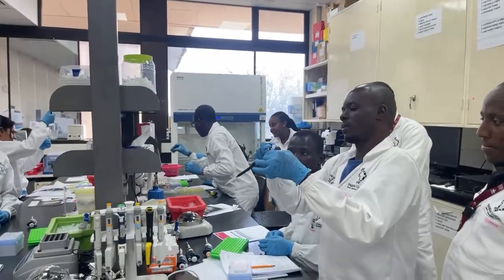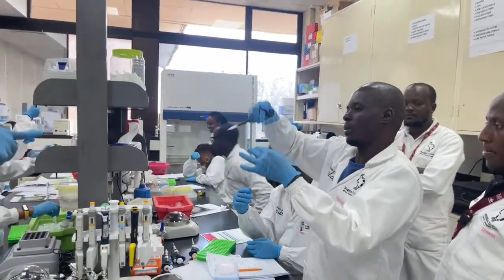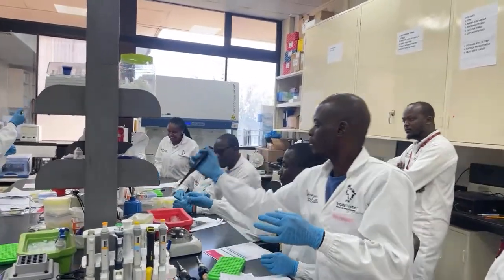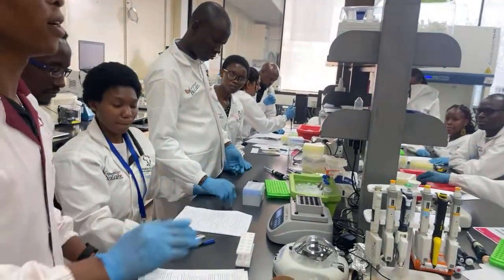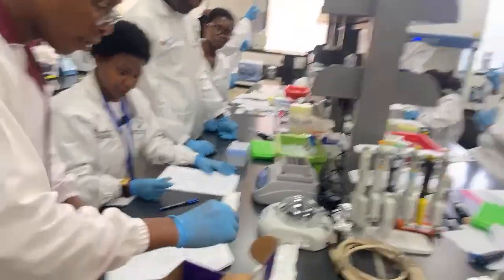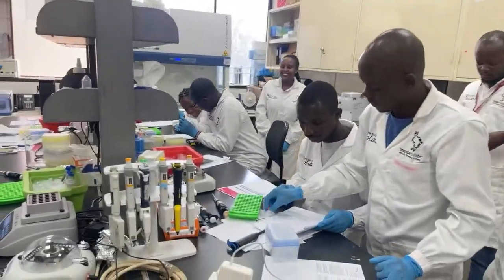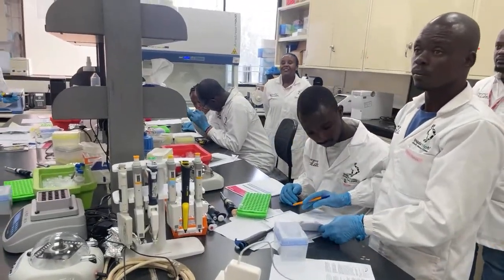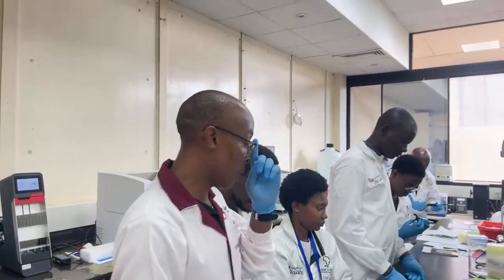If you've taken 300, it's fine. Guys, you only need 300 microliters. If you still have something remaining, it's perfectly fine. And then the next buffer is BL3. So you notice here you start seeing some cloudiness. That's where your DNA is. So you need about 50 microliters.